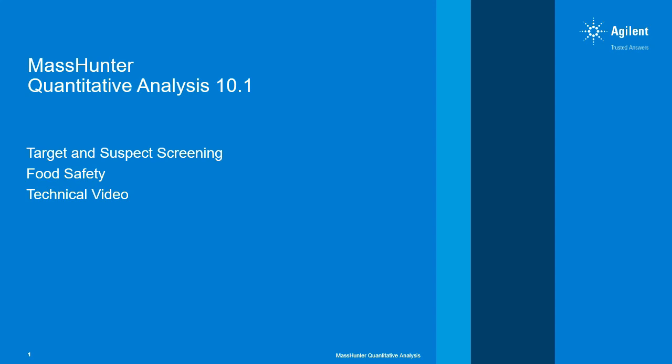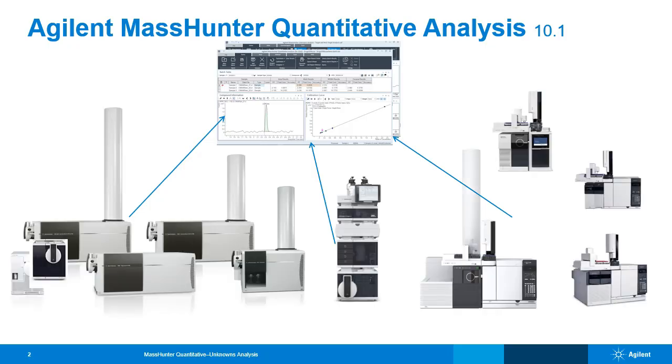Welcome to MassHunter Quant 10.1, featuring target and suspect screening, food safety. Here we go.